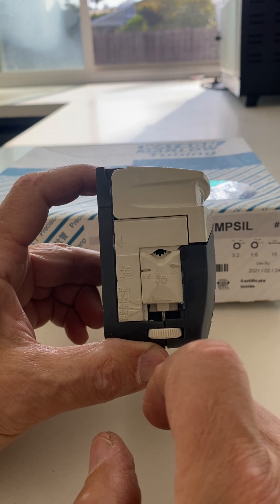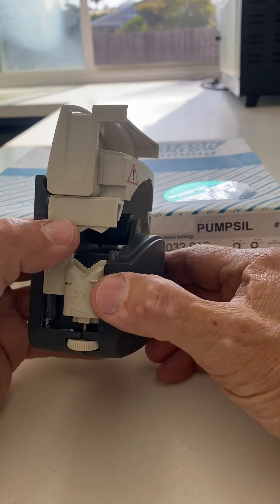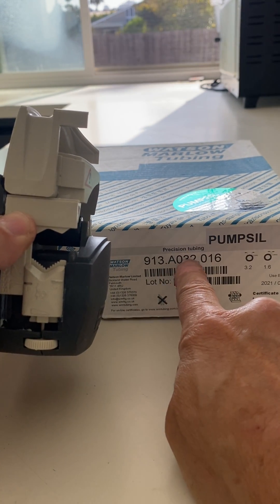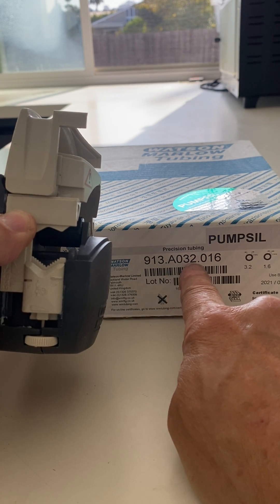All you do is you open the pump head. If you don't know the ID of your tubing, in the Watson Marlowe part number, the middle numbers are the ID of your tubing.